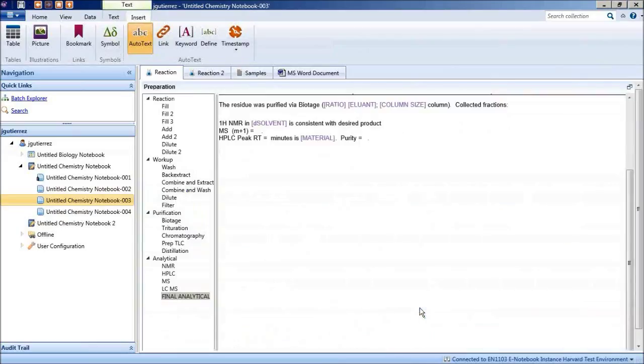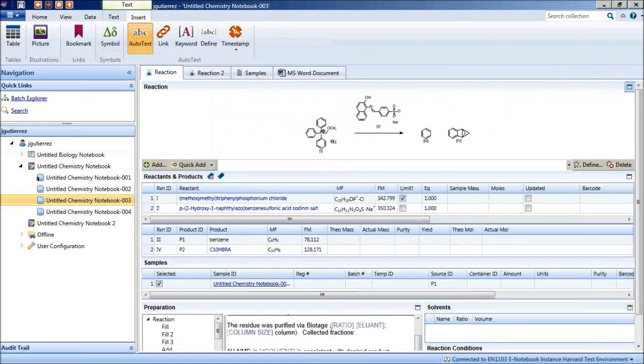Any questions about the auto text enhanced support? So Juan, is this where we would have some integration with the inventory, inserting reagents, things like that? Yes, that is not 100% available right now in the Citrix environment. Okay, but that's where we would see it.